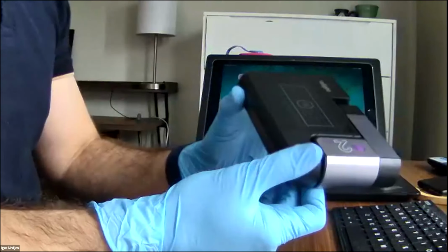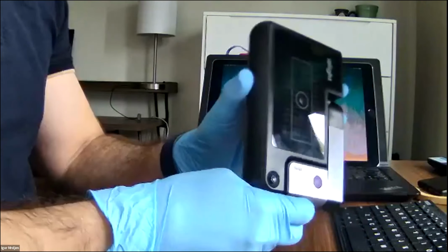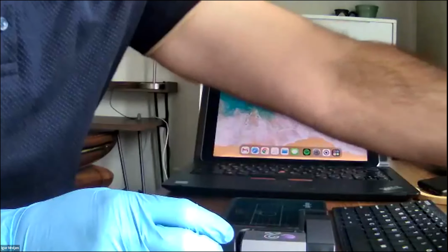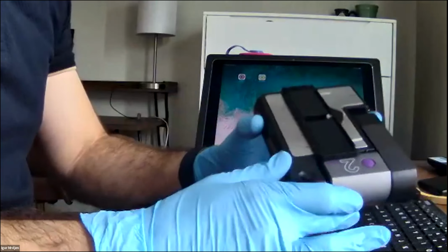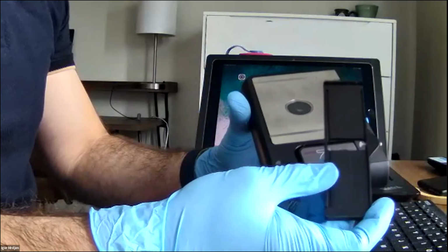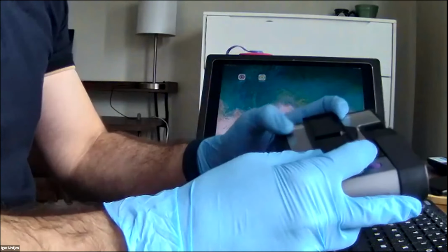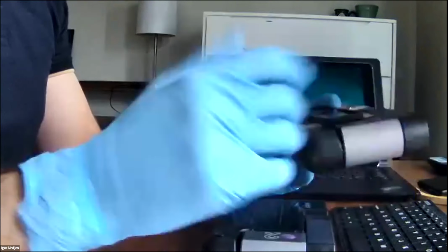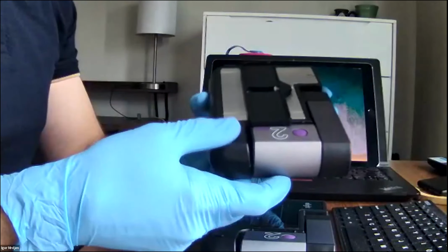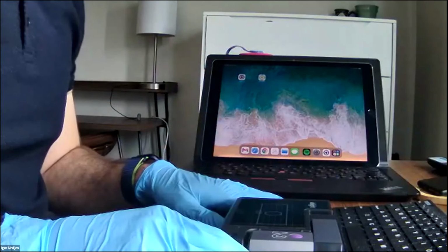So these are the ioLight microscopes that we use to analyze our samples. Like I said, they fit into a backpack, into a cargo pants pocket, and so forth. You also may see or want one of these ones with what they call the XY stage attached. The XY stage is basically a holder for your microscope slide that is magnetically attached to the stage, so that if you're on a boat or anything like that, this holds firm so that it doesn't get away from you while you're working. For the sake of this demo, I like to use this one just because it keeps things steady and keeps wind from driving stuff off. But for the sake of this demo, I'm just going to use the traditional 2mm ioLight microscope.